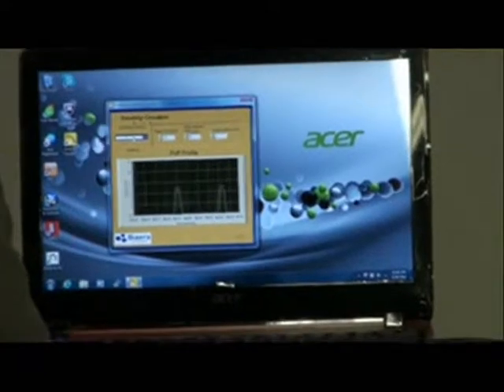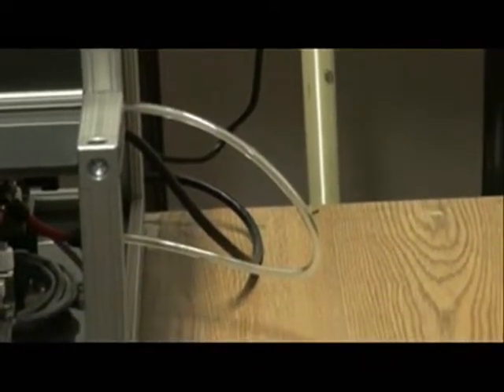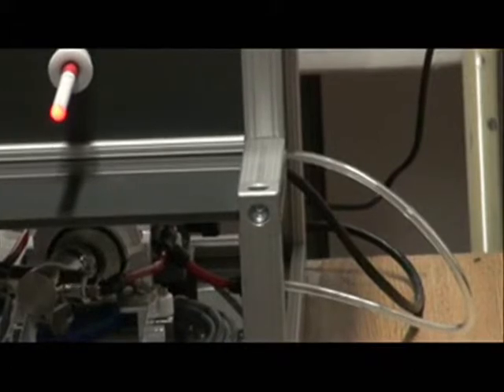One can observe in the outlet tube of the machine, actually we can now see the vapors of the e-cigarette going into the siphon. So now that we have started pumping in the aerosol from the e-cigarette, we start the siphon by clicking the button, Start Siphon.